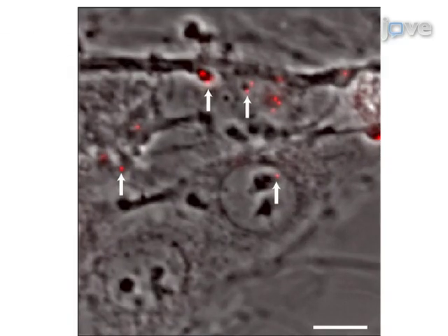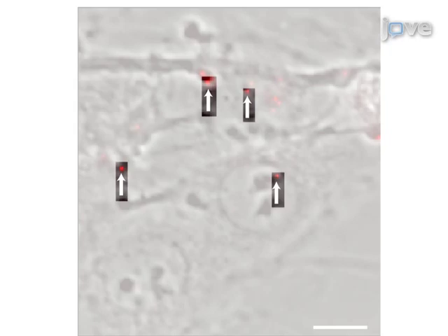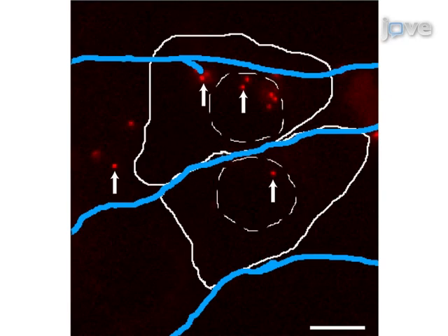The white box highlights an area of the recipient epithelial cells containing infecting capsid assemblies. Here, the same area as in the previous image, as viewed through the RFP channel only, is shown. The solid white line denotes schematic representation of the cell outline.